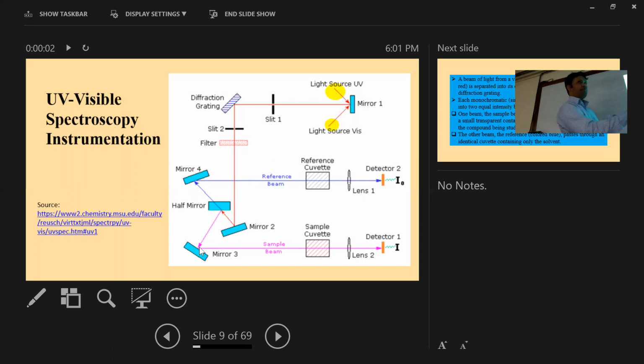This is our sample, and it is absorbing the light, a little bit or not at all. How much is it absorbing? If it were water here, it should absorb the same amount, but as it has some substance which can absorb more light, it will transmit less. If it does not absorb at all, it will transmit all of the light. What I have shown here is absorbing or reflecting most of the light and not transmitting at all.